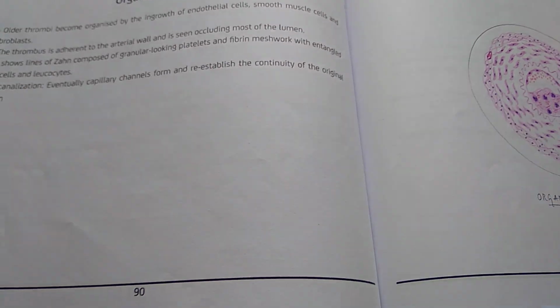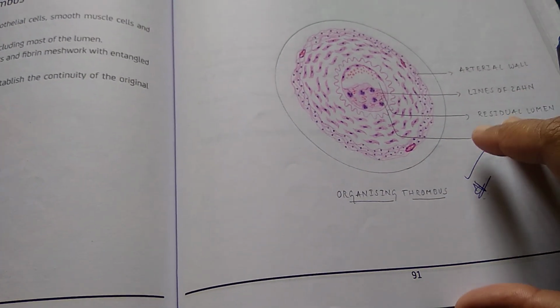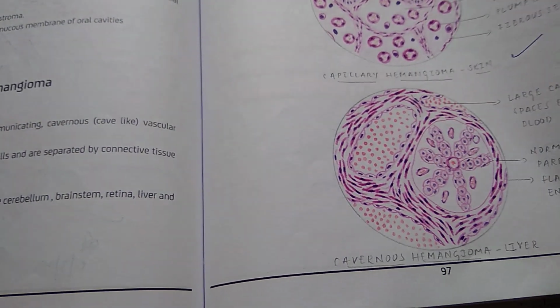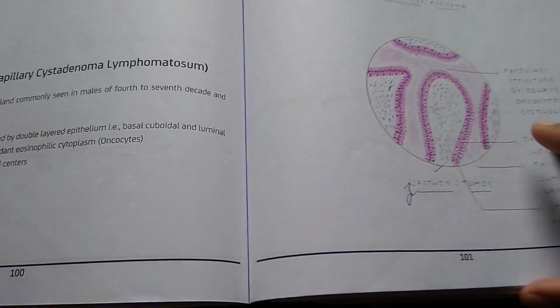Just going to turn a few pages here, guys, so that you can save some time. Organizing thrombus. What is this? Cavernous hemangioma, capillary hemangioma, bronchogenic carcinoma. Then what is this?